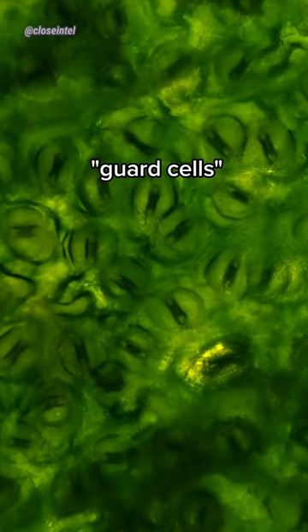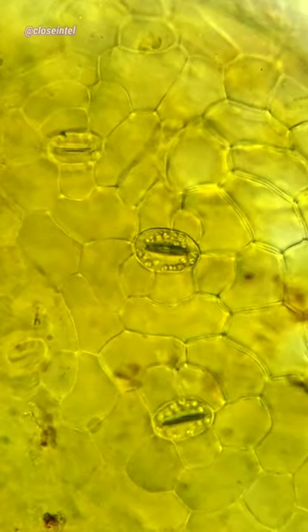It's a type of pore found in the epidermis of leaves, stems, or other parts of the plant that involve gas exchange. They're surrounded by a pair of kidney-shaped cells called guard cells that help to open or close the stoma, and it's what gives them that mouth-looking shape.